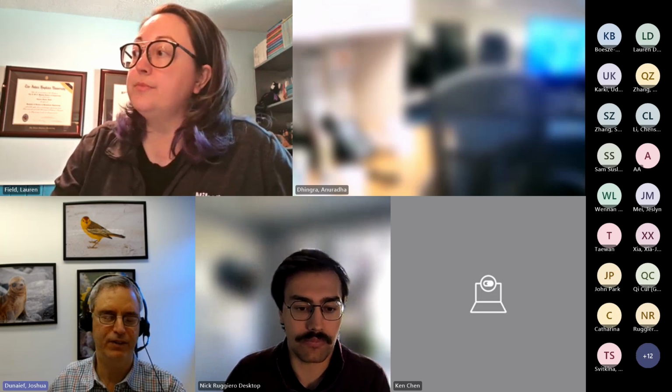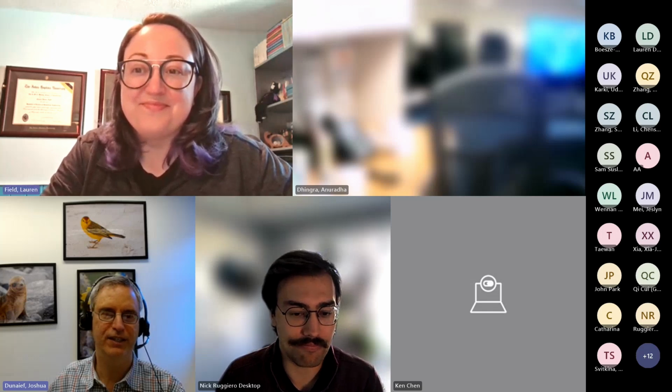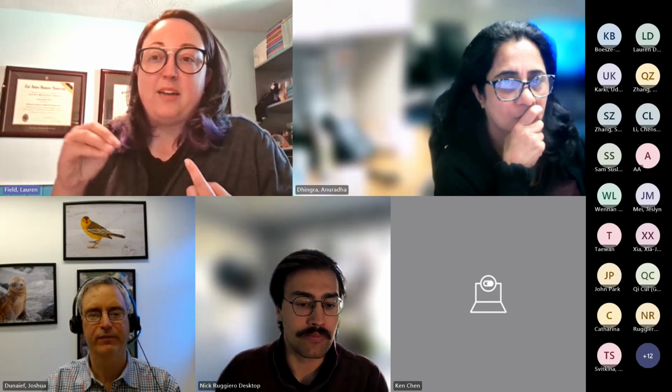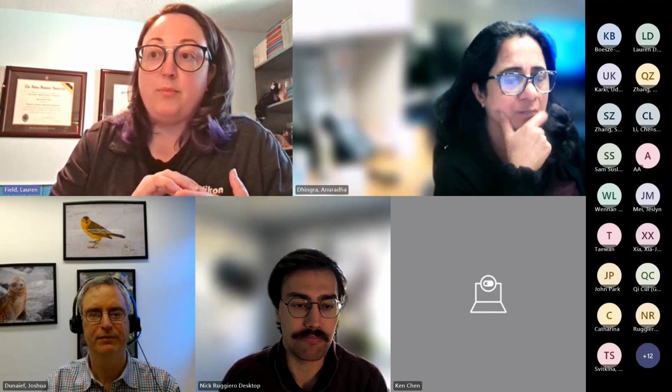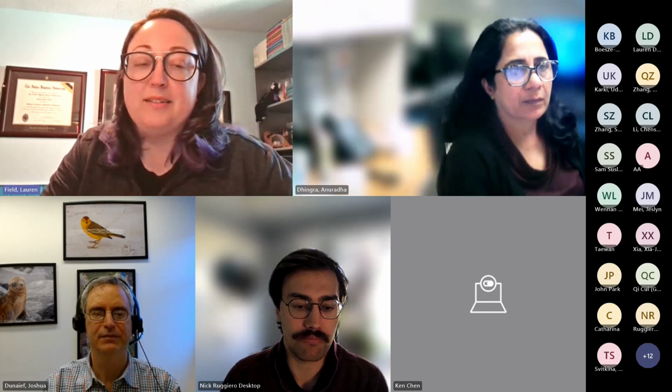Yeah, I would think you'd have to disclose that you used AI to process the image, and this is how you did it. So are you seeing that, or have you looked at publications where people are doing that? That was why we built in the save export functions so that people could export the AI algorithms. So you can get a specific AI file for any of the ones that you've produced. You can share them with colleagues or with anyone who wants to replicate your data or see what you did. And you can save out GA3s. So they are designed to be shared between groups and papers.